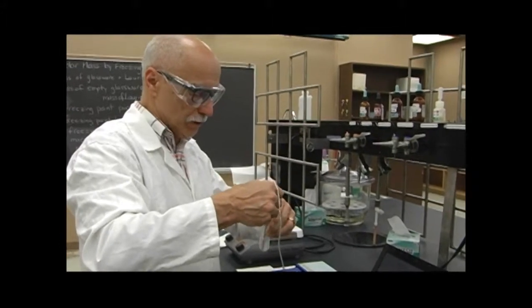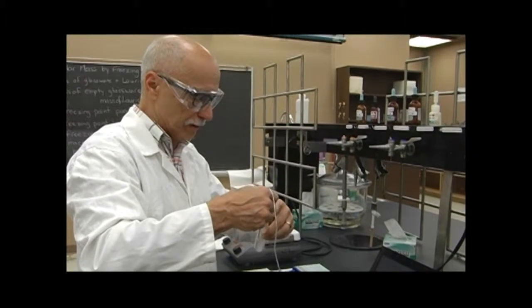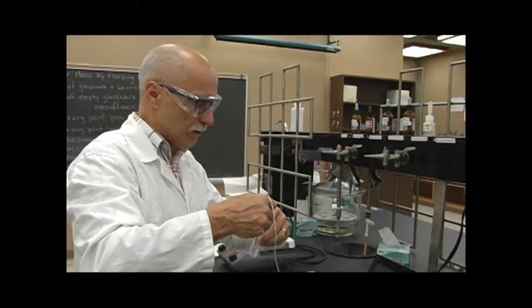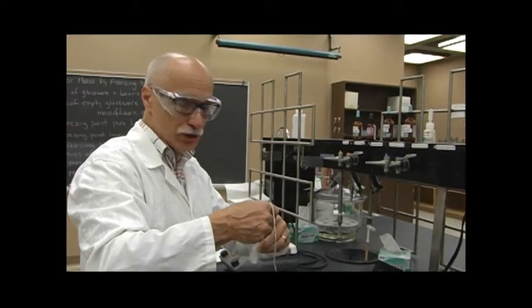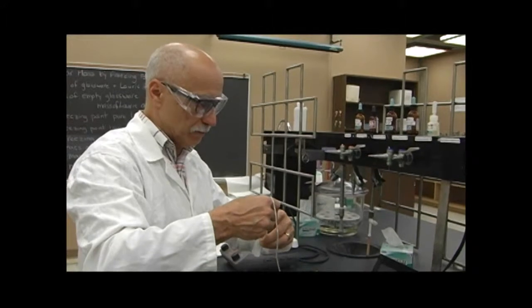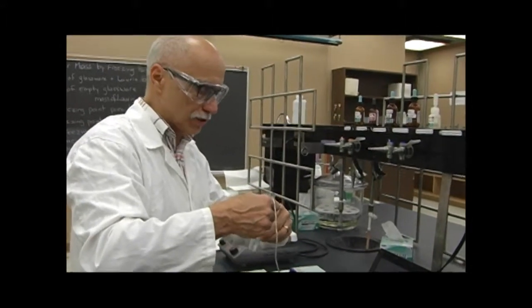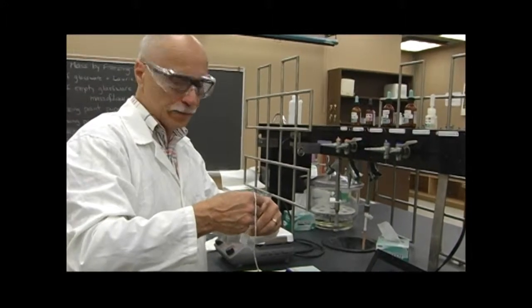If you were to look in the textbook, you'd probably find that the freezing point of lauric acid is around 42. But we're concerned more about the change in the freezing point rather than the absolute freezing point. So this could be a function of the purity of the lauric acid, a thermometer calibration.